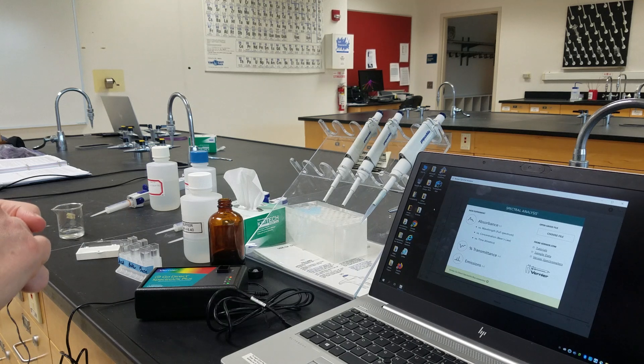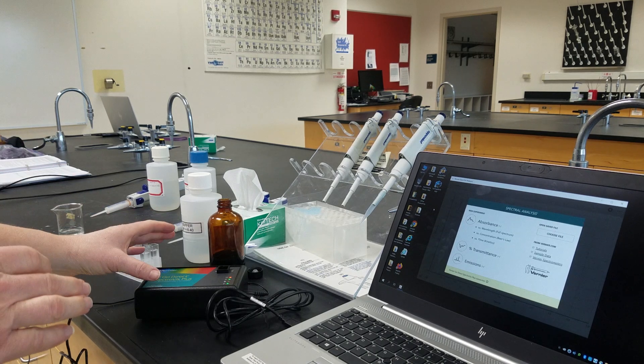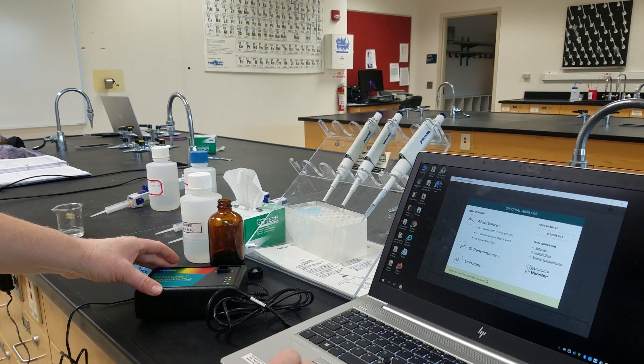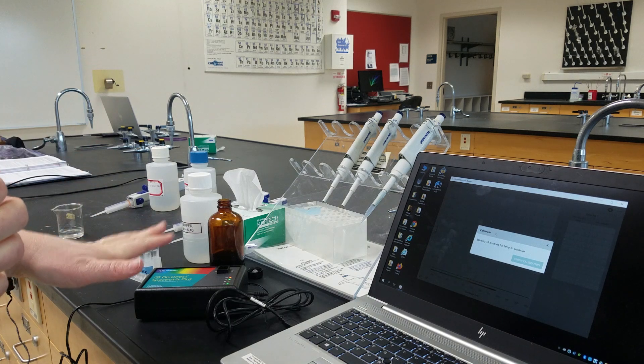We're going to work on the pKa of an indicator, and I'm going to start by setting up the software. I have my spectrophotometer plugged in. We're going to look at the absorbance of the full-length spectrum, so we're waiting for the lamp to warm up.